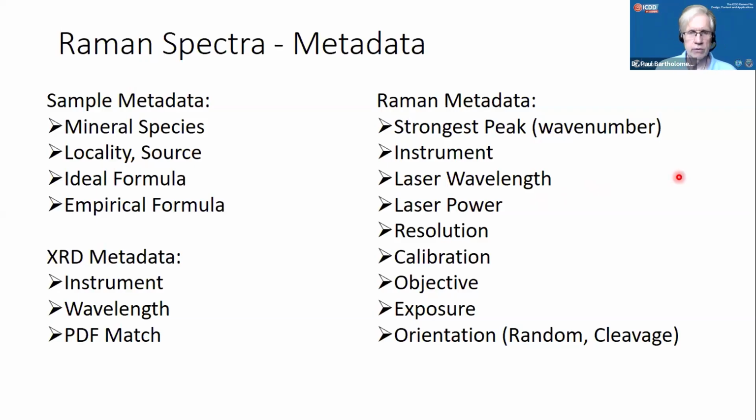Most of this is done, well, actually, all of this is done with Raman microscopes. So what objective was used? Exposure time. Orientation: it's not a measured angle, but is it a random orientation or is it sitting on a cleavage face? That is some basic useful information.